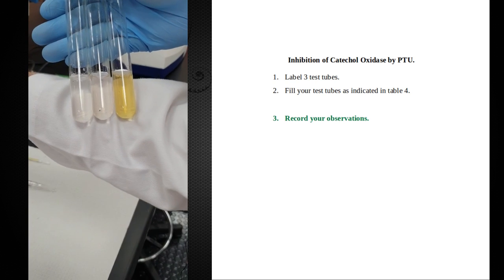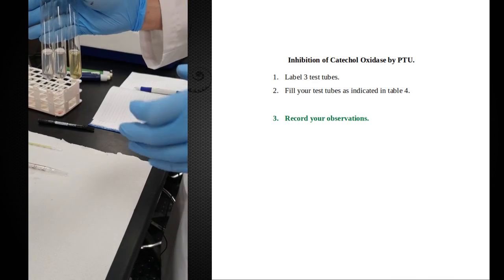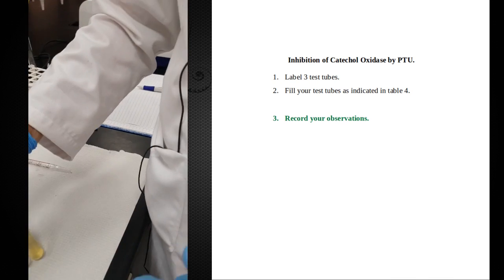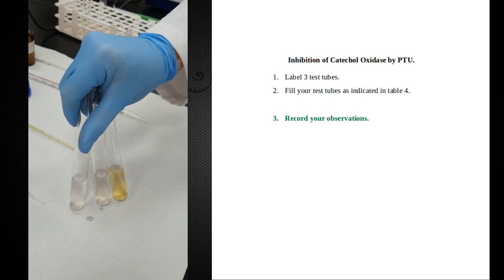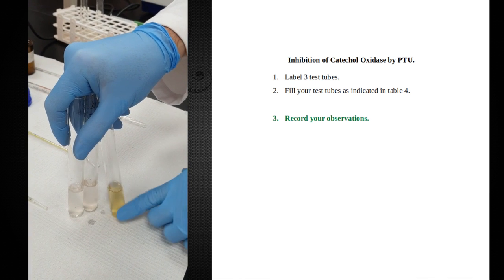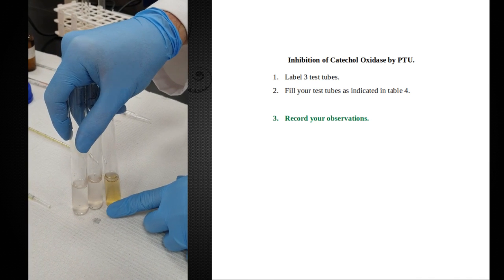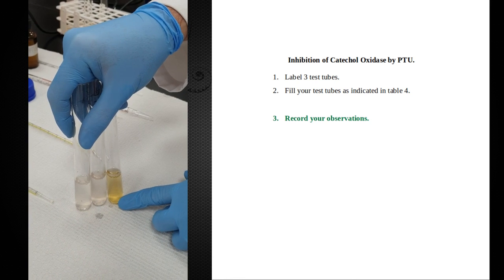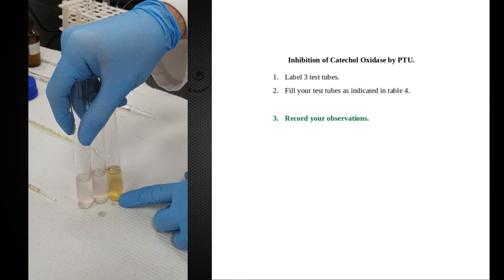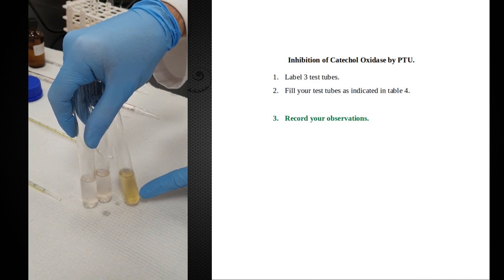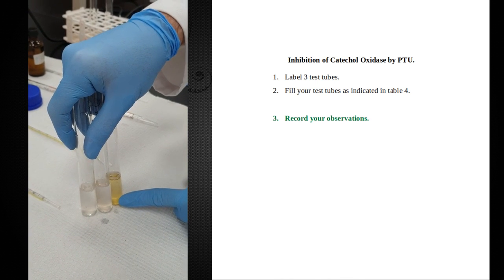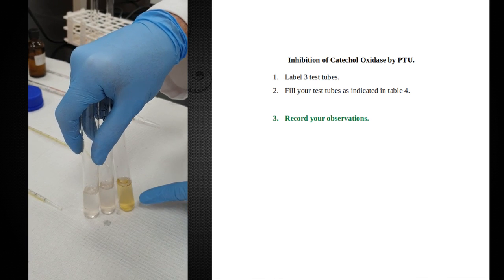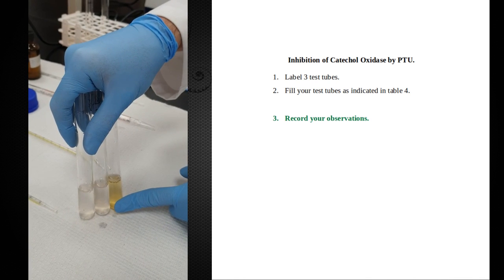So the question is, what would we call this tube? Based on past experience, most of you probably would say it's a positive control because it did not get PTU. Yes, it is a control, but this is a very common mistake. Just because it has color doesn't make it a positive control. Always think about what was the purpose of this experiment. The purpose was to determine the activity of this PTU inhibitor. Tubes one and two got inhibitor. This one did not get inhibitor. If you do not add the thing you're testing for, that means this is a negative control. This is what it shows us when there is no PTU activity. The other two test tubes did both get the inhibitor.